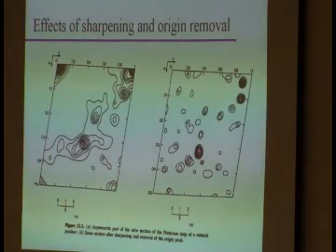So what does this look like? Here's a map that is just plotted as a function of the F squareds. Here's what you get if you plot the E squared minus 1 values. Okay? This big origin peak, which tends to swamp certain things, is gone. And instead, you get a bunch of peaks. And I don't think anybody would have trouble to identify the 3 strongest peaks in this map. Right? This one, for example, was swamped by the origin peak before. You can still tell that there's something here, but it would be more difficult to locate that peak.